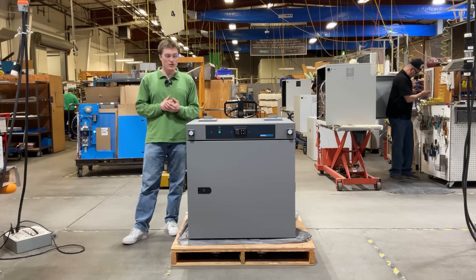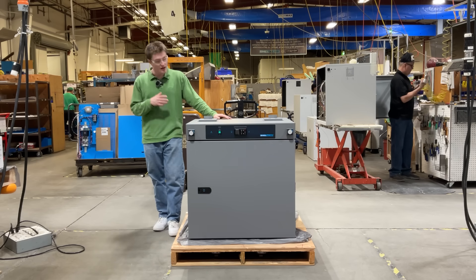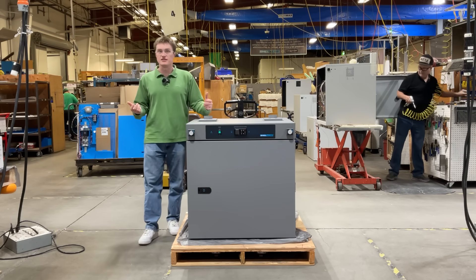With a 4.9 cubic foot chamber, this oven provides the perfect solution for high volume drying, curing, sterilization, and temperature testing needs.